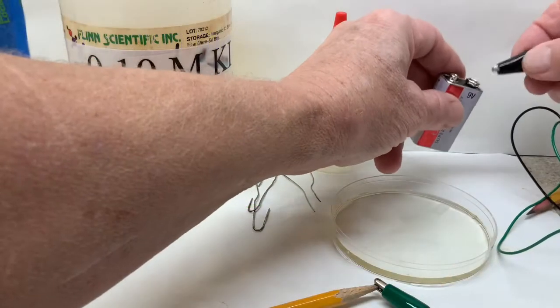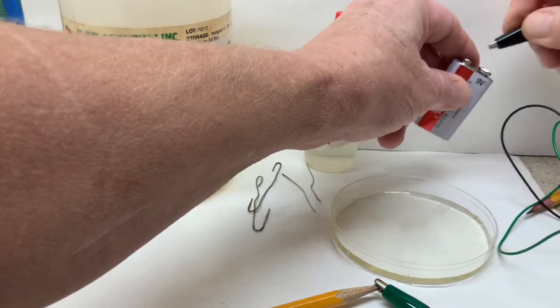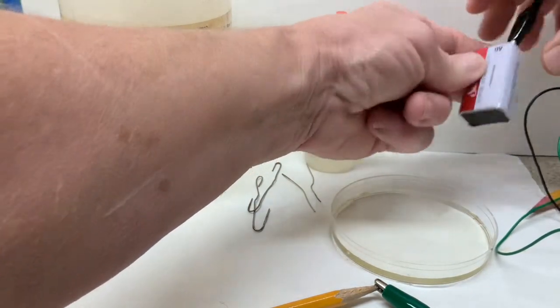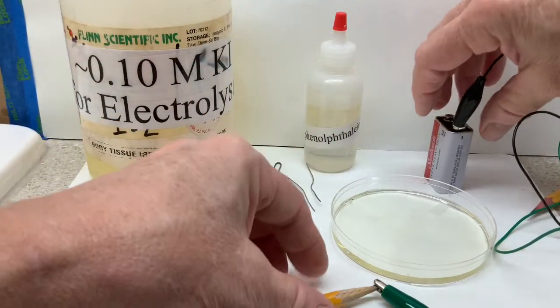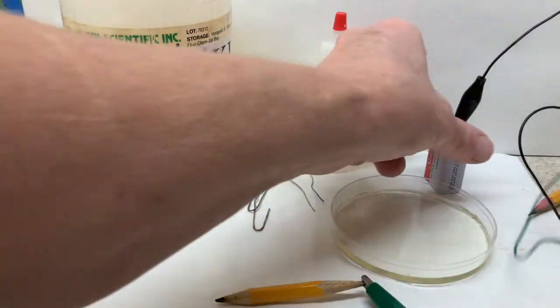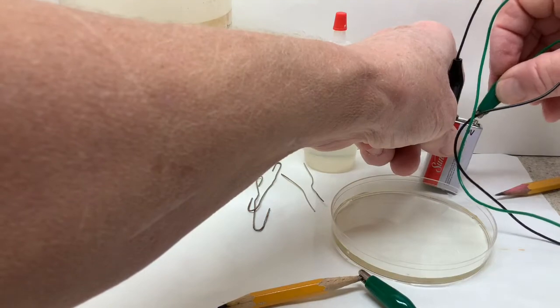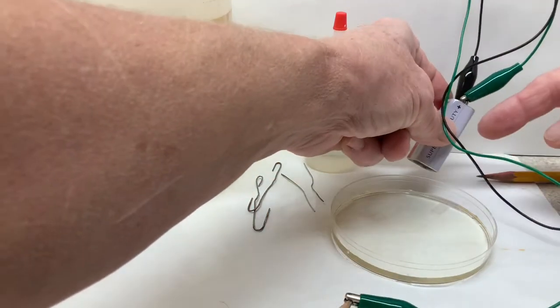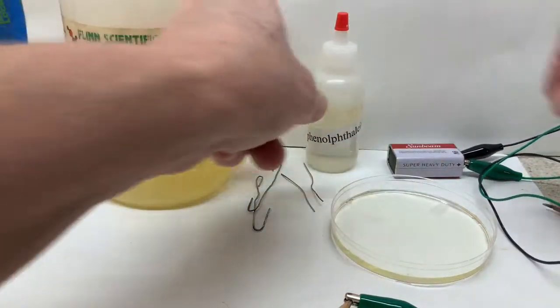The marking that is negative is the end of the battery in which electrons come spewing out. Throughout this video that will be the black alligator wire, and the green wire will be connected to the positive end of the battery.